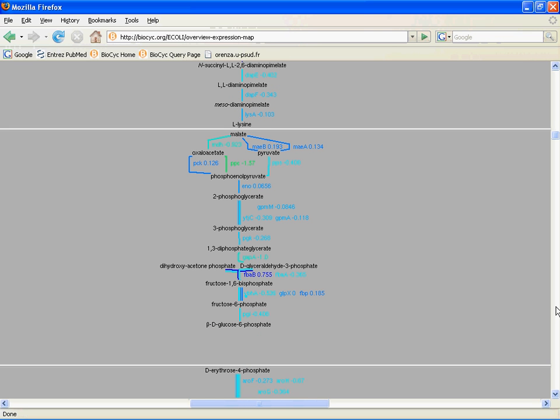So if you don't want to look at the overall display, if you really do want any pathway with a gene whose expression has changed, in this case 4-fold or more, then you can do something like this. You can set your own cutoff, get a pathway list, get everything painted onto the pathways, and have another convenient at-a-glance intuitive view of just what your omics results mean.